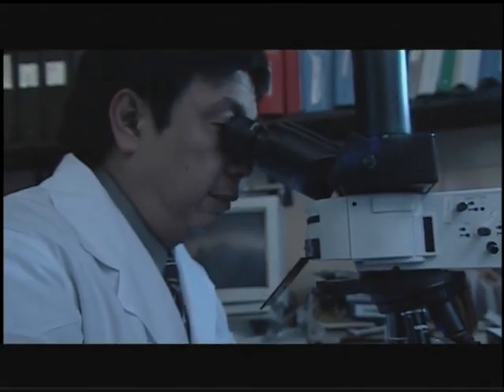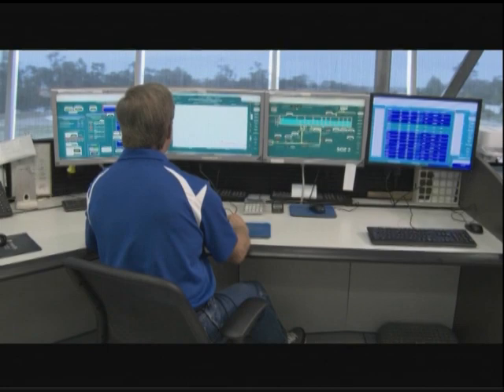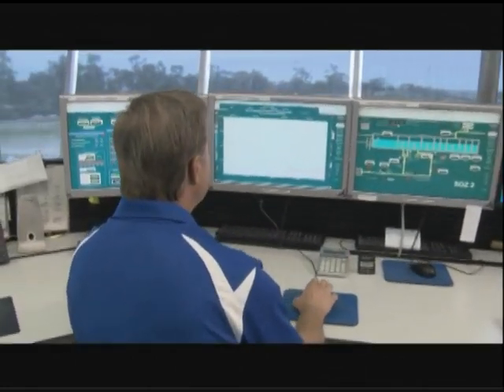They represent particles in the 2 to 10 micron size range. By carefully watching the number of those particles, an operator can optimize coagulant dosage to minimize the number of Crypto and Giardia-sized particles that will pass out of the filter.